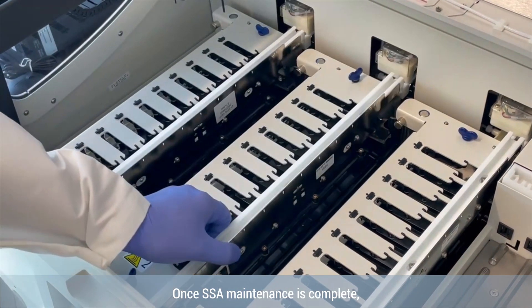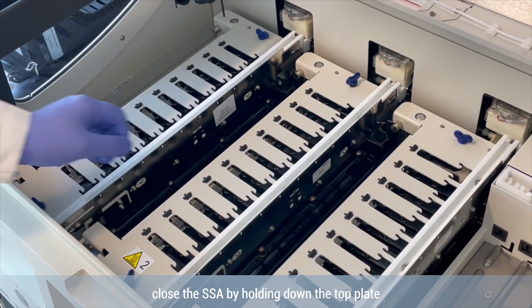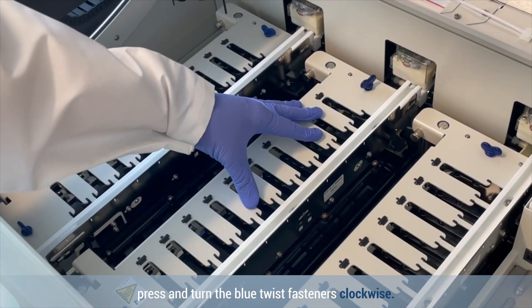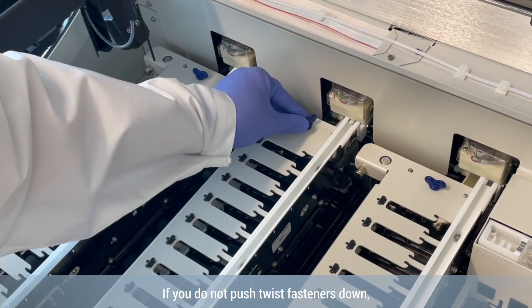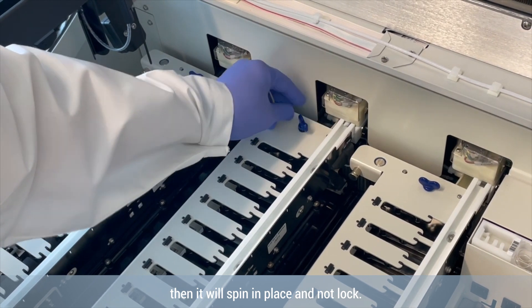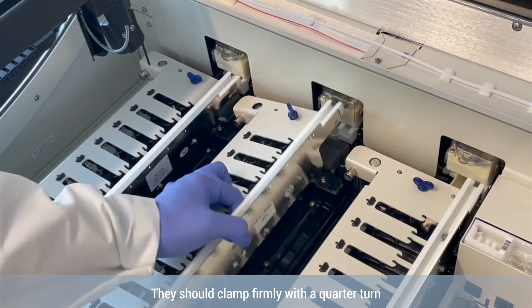Once SSA maintenance is complete, close the SSA by holding down the top plate. Press and turn the blue twist fasteners clockwise. If you do not push the twist fasteners down, they will spin in place and not lock. They should clamp firmly with a quarter turn.